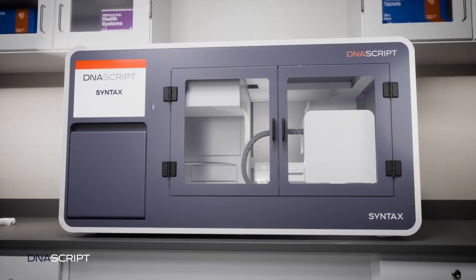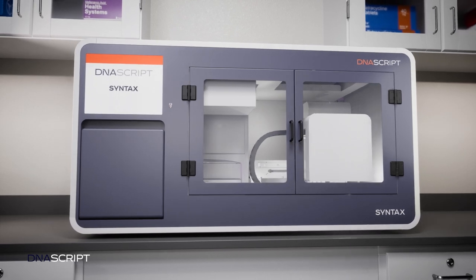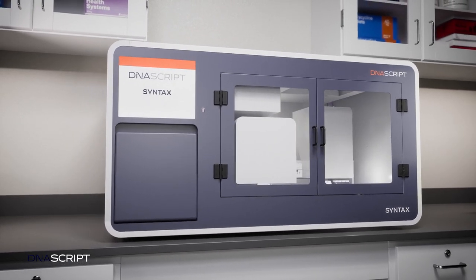With the Syntax system, oligos are printed in your lab and ready for use in as little as six hours.